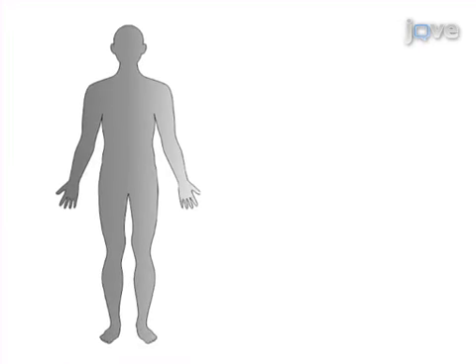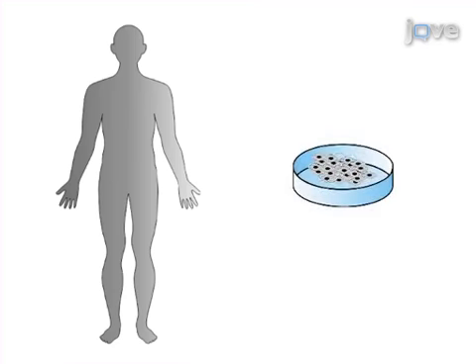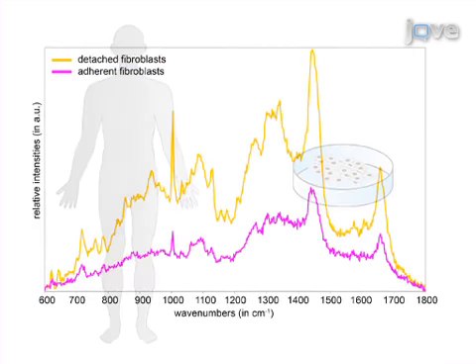The resulting spectra can be used to check the integrity of tissues after harvesting a biopsy, or to prove the sterility of isolated cells. In addition, this technique enables the characterization and identification of different cell types in vitro. Ultimately, Raman spectroscopy is a promising laser-based technique for tissue engineering and clinical applications through non-contact, label-free analysis.